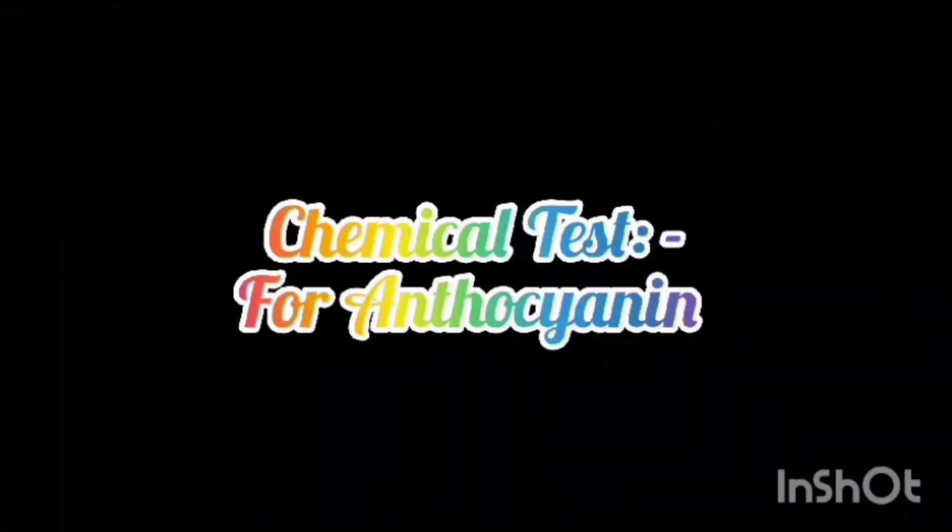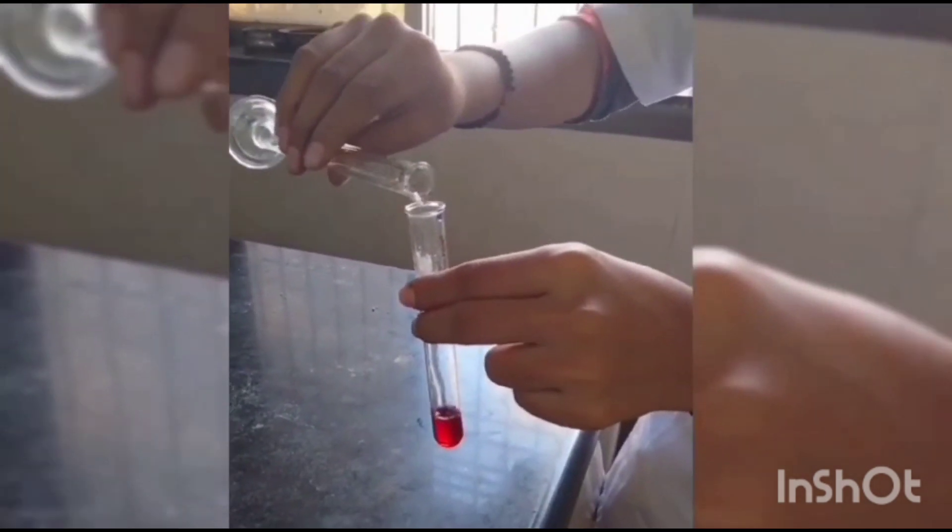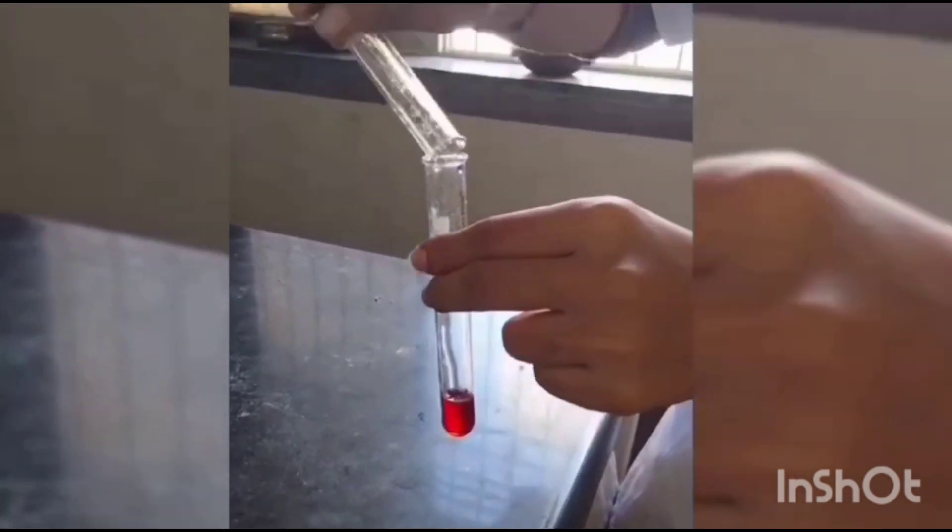Performing Chemical Test. First is the Sulfuric Acid Test: 1 ml of concentrated H2SO4 was added to 2 ml of extract. The presence of anthocyanin would be indicated by the orange coloration of the extract.